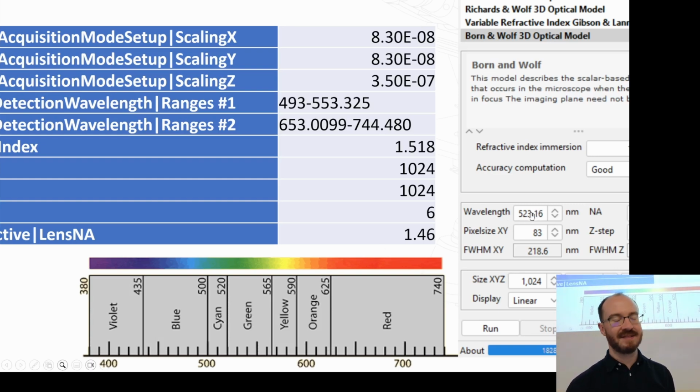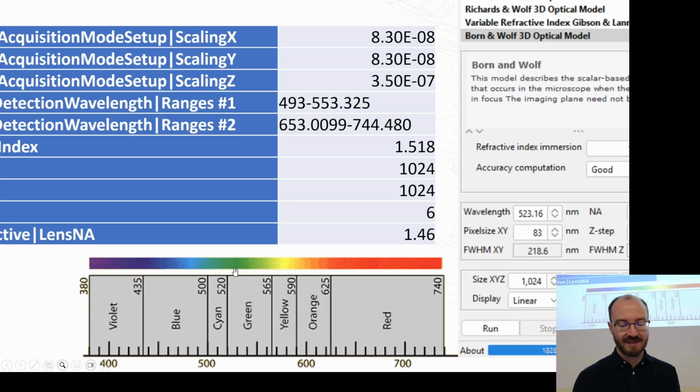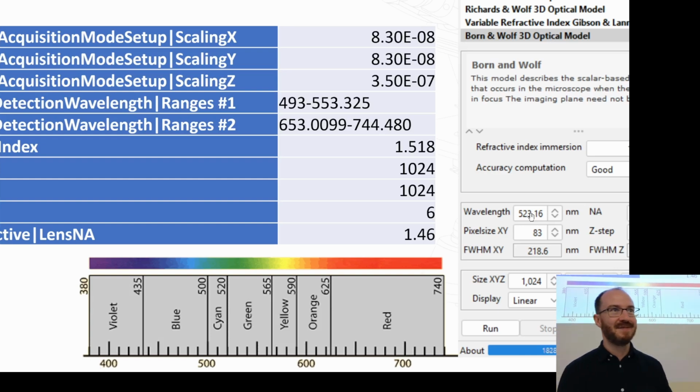It's like, well, that doesn't really make any sense. There's no way that the wavelength could have shifted that far down from excitation to emission. I'm expecting it to be in this range. So it should be somewhere in the 500 range, and we found out 523, which makes a lot of sense. So just having that intuition, how does the wavelength match to the color? Because there is color that you observed, it's just a sanity check, just a good thing to keep in mind.